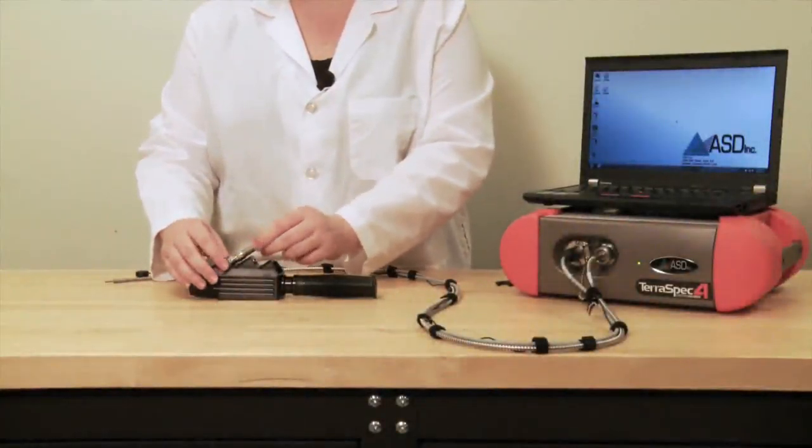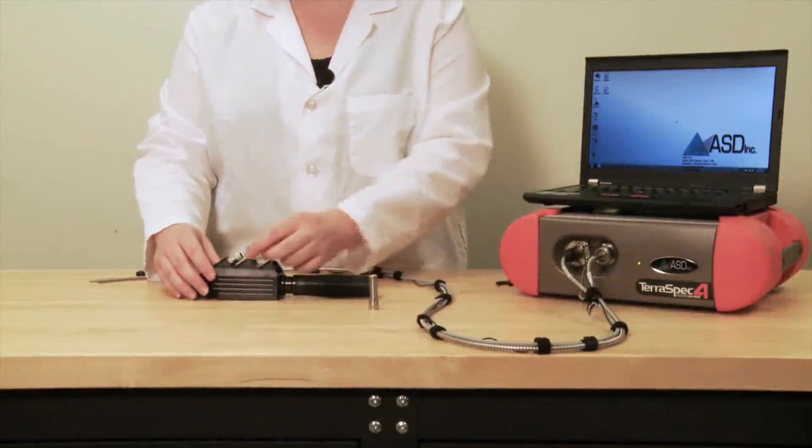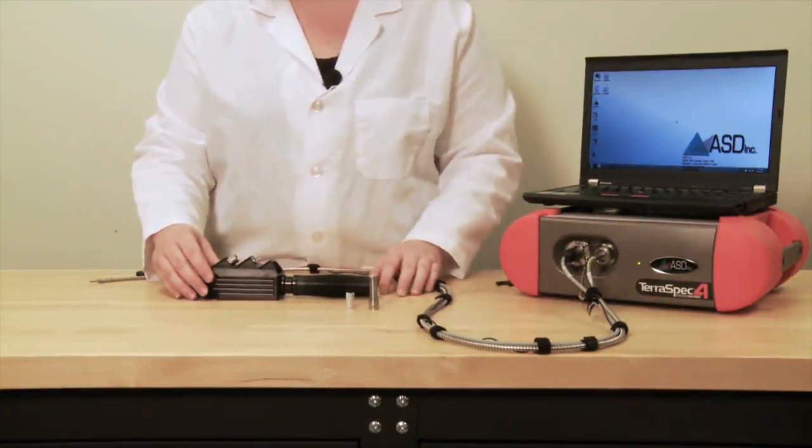Unscrew the metal strain relief sleeve on the contact probe. Remove the plastic sleeve underneath the metal strain relief sleeve.